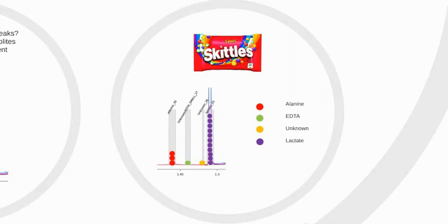Now, if we repeat what we have done on our crazy sours bag, we could then compare the two spectra to see if they have the same skittles or different ones or different amounts of the same skittles. Applied to metabolomics, this means we can compare experimental groups and start to conclude similarities and differences which might be characteristic of what we are trying to investigate.